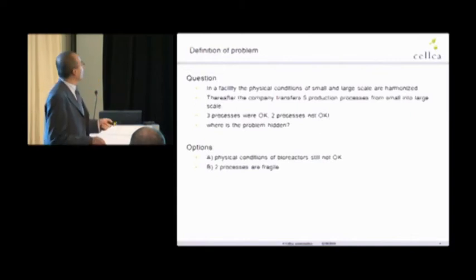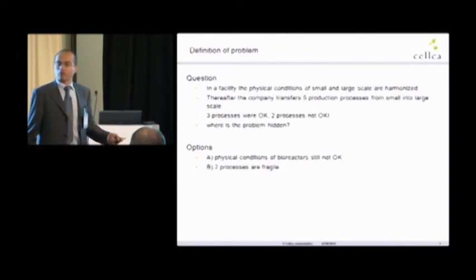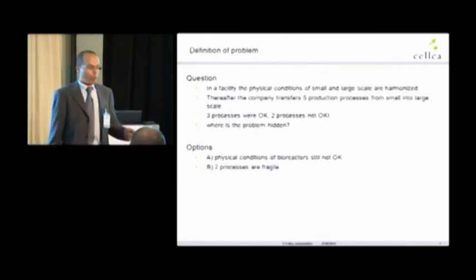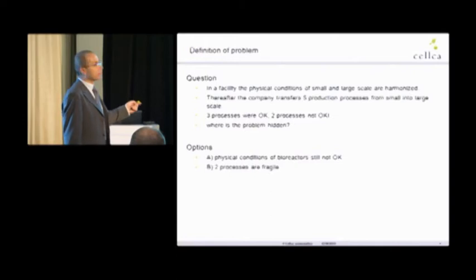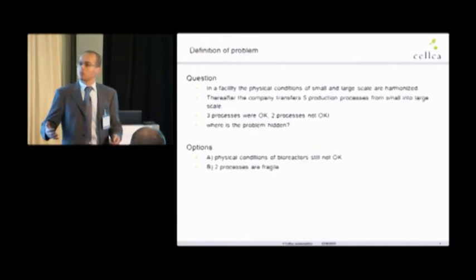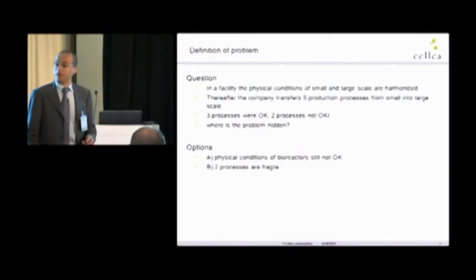That means titer or product quality is not comparable. What should we do? Where is the problem hidden? We have done the characterization already. What should we do then? Why do we have three processes which run smoothly and two of them not?